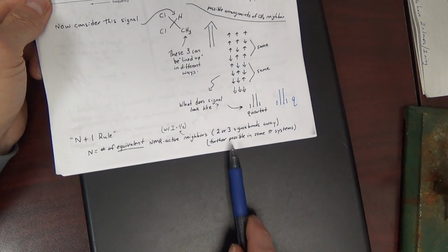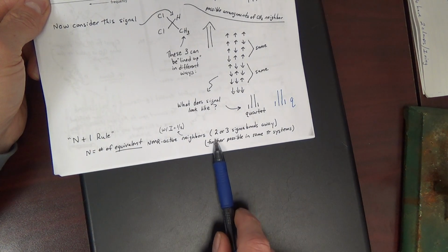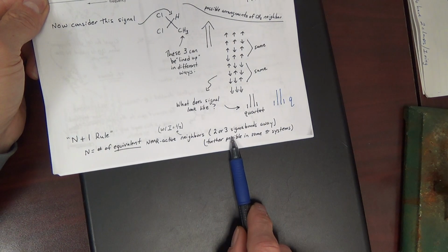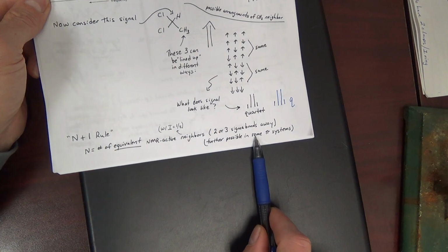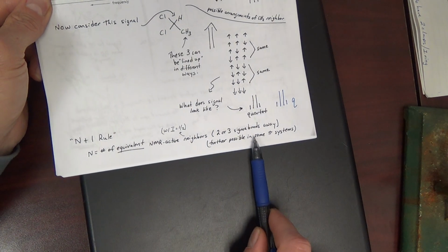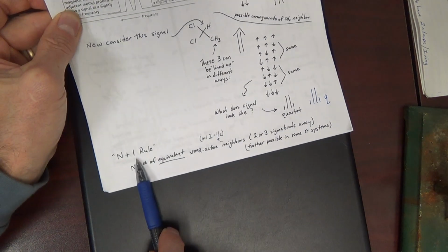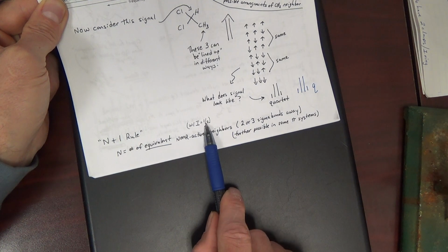Now, in certain pi systems, the coupling can take place at longer distance, beyond 3 sigma bonds. We will possibly see that, but it's going to be sort of an exception. NMR active neighbors: the n+1 rule only works when the neighbors have a spin of 1/2.